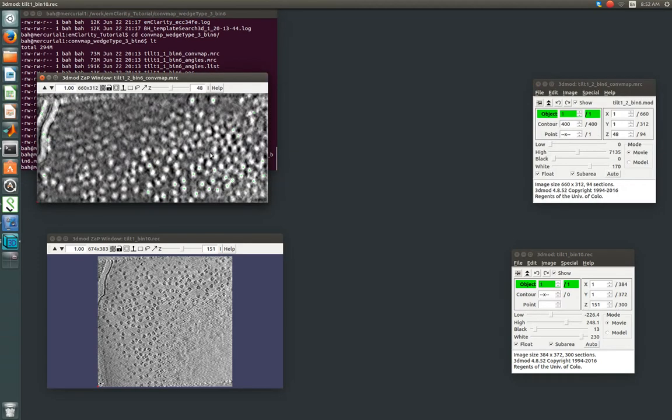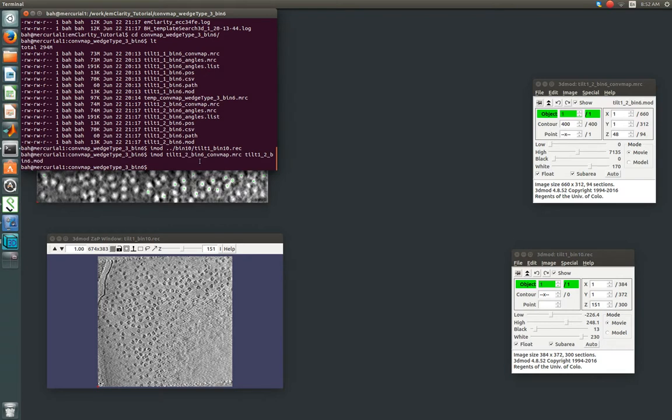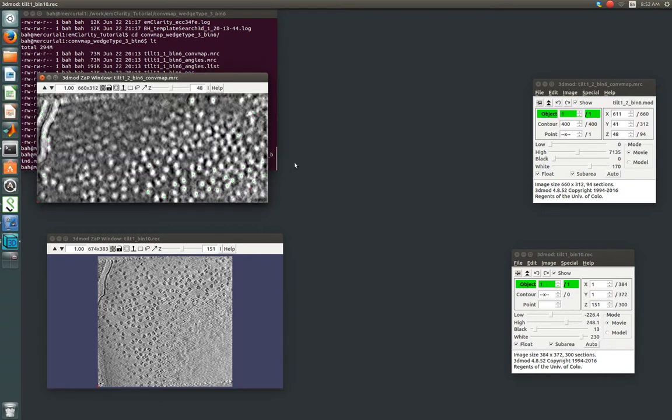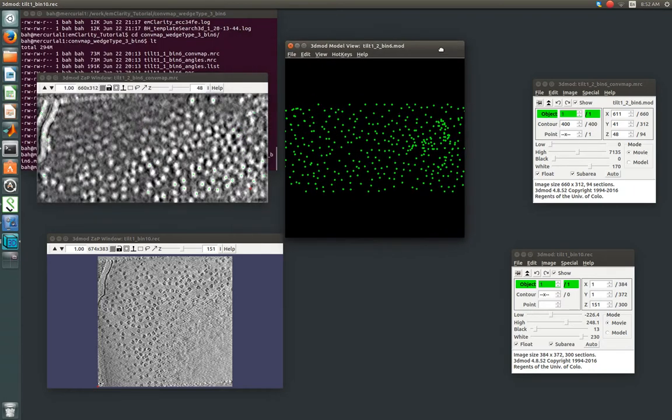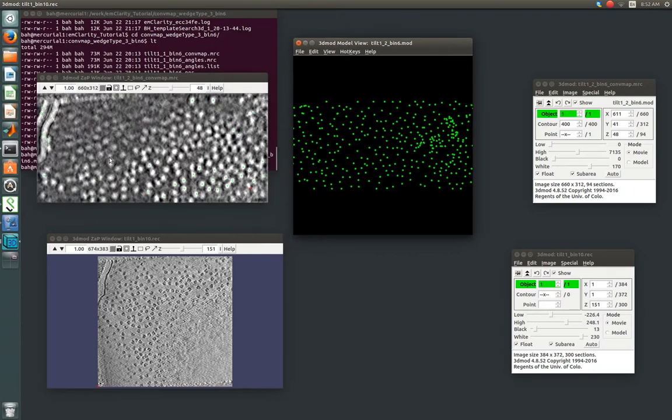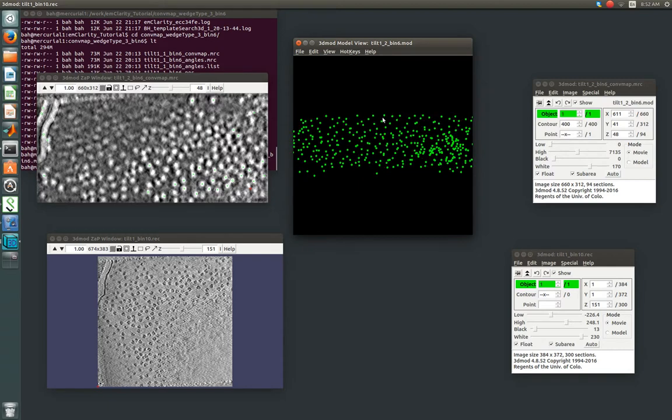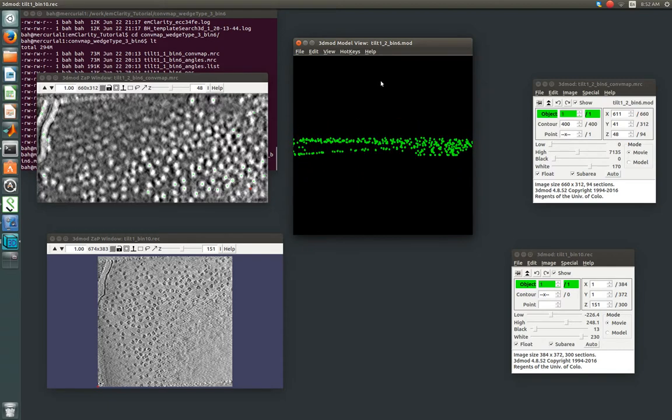So in iMod, we open up the convolution map, and then you can just put the model file name after it. And then we're also going to strike the v key, which will open up a 3D model corresponding to the same points that are lit up over here. And you see immediately in the model, it's pretty clear that we have our layer of ribosomes near the surface, our secondary layer here.